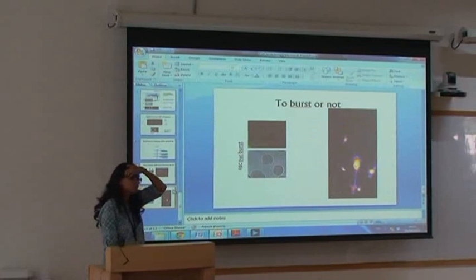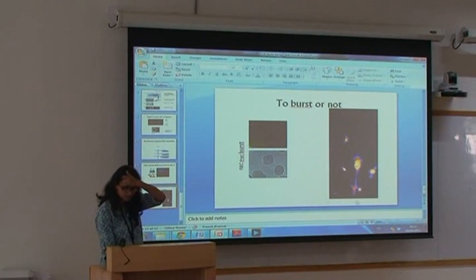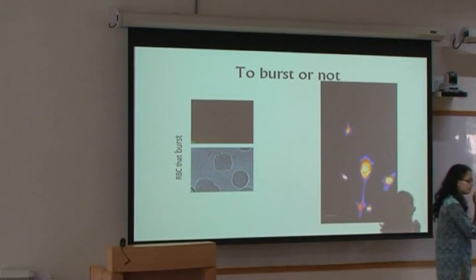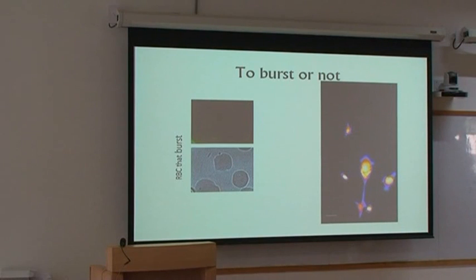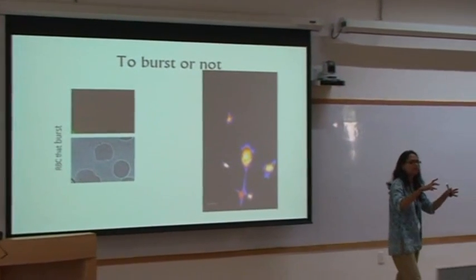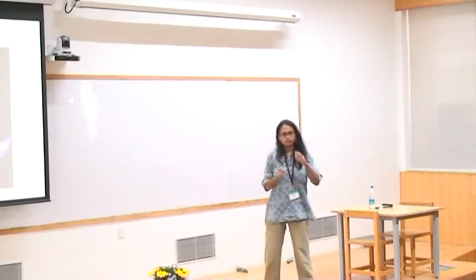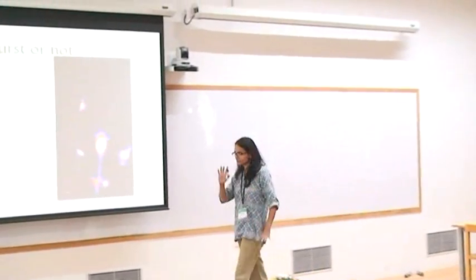The last thing I want to tell you: right now we have GFP, GPI marked, and that's what we are trying to image and quantify. But our backup plan, in case we can't really catch the fluorescence in a quantifiable way, is to load the cells with something which is fluorescent and cannot escape from the cell. It is caught inside, and it can escape only if you rupture the membrane.